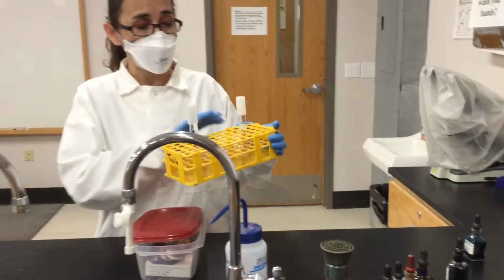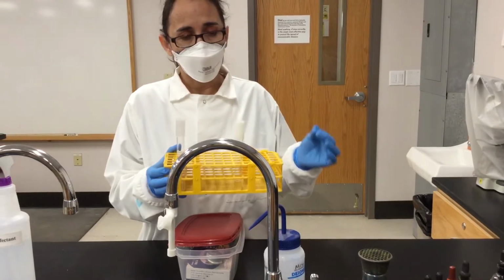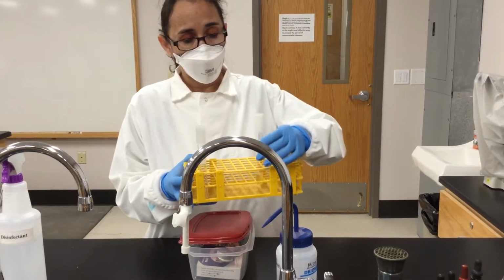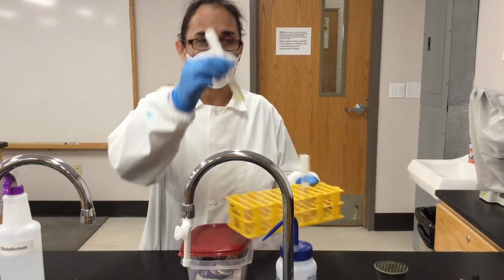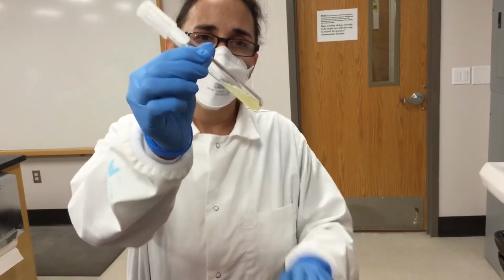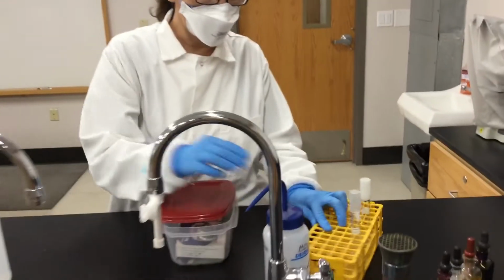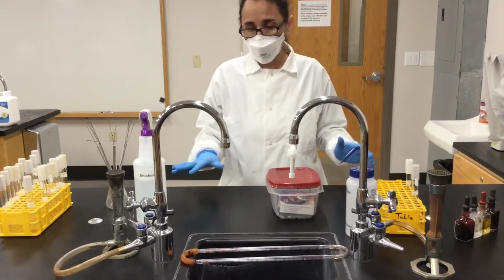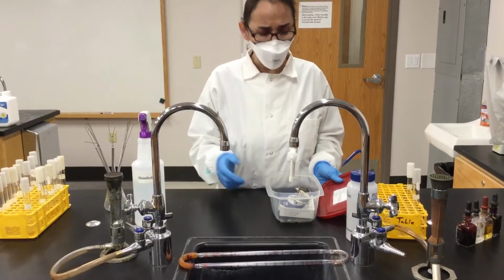So in this case, I'm going to use Micrococcus luteus, which is a small spherical-like bacteria. And this is a broth, and this is a slant. A slant is a solid media with a little bit of an incline to it, and you can see the growth of the bacteria there. You have to keep it in your rack, and anything that you have on your countertop shouldn't be close to the edge, otherwise it will fall. So those are general precautions.